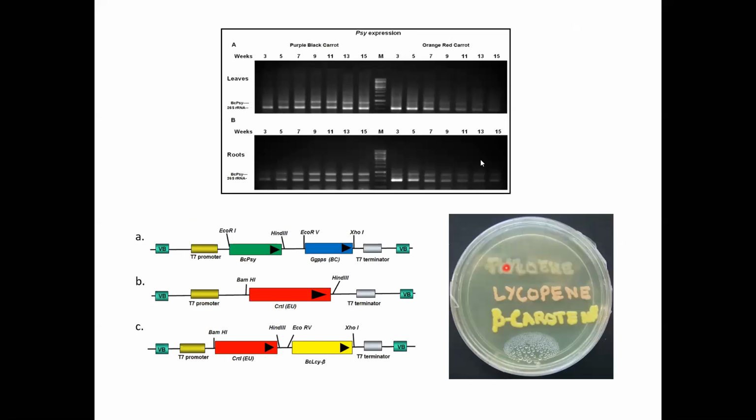So when I was doing my PhD, we were doing expression of phytoene synthase and phytoene desaturase genes from bacteria. We did not have a real-time PCR, so I used semi-quantitative PCR. So you can see the bands here. Here are the PSY bands, and here the control we use is 26S levels of RNA.